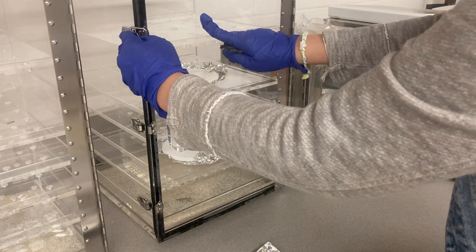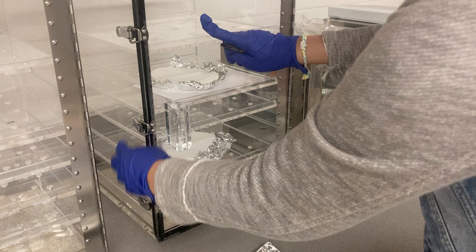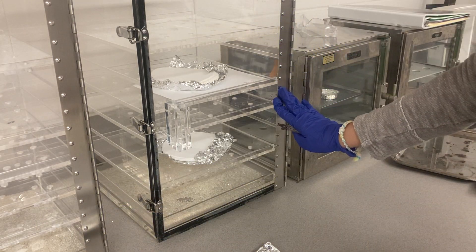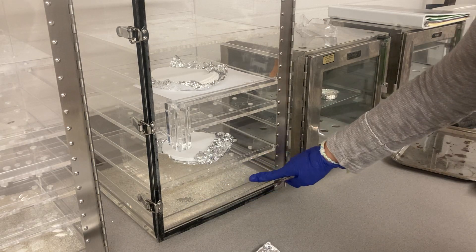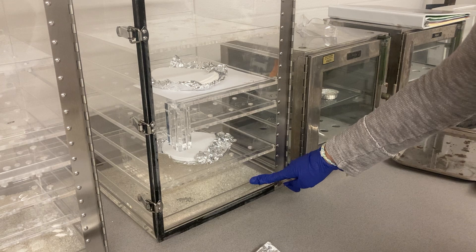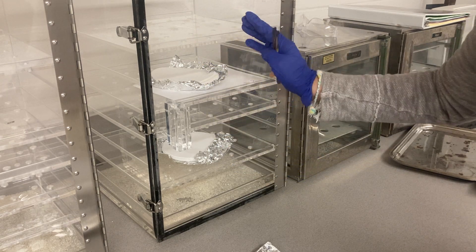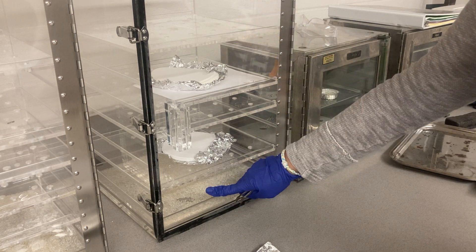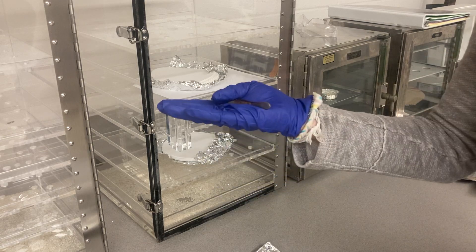Let it cool down in this cabinet — this cabinet is called a desiccator. The desiccator is a sealed cabinet, completely sealed. At the bottom they have silica gel to absorb the moisture. If there is any moisture or water inside this cabinet, it goes to the silica gel.